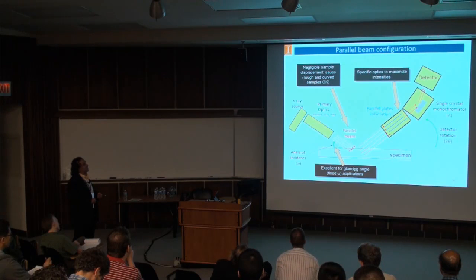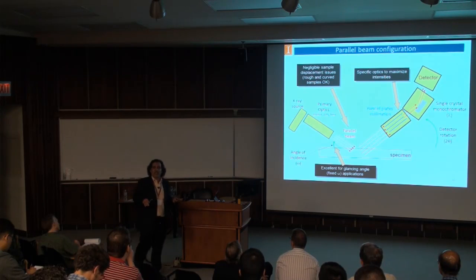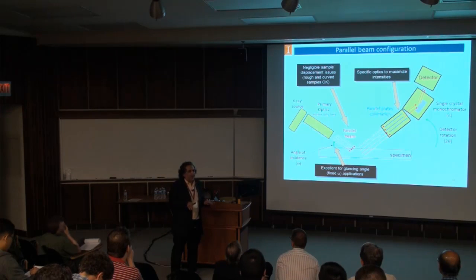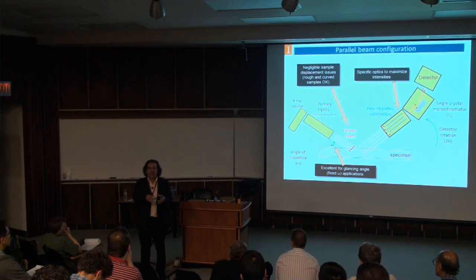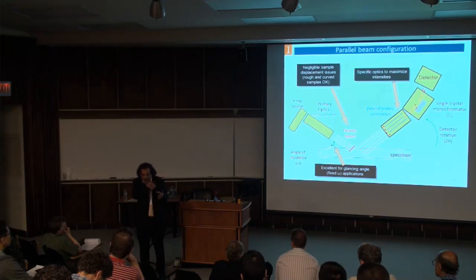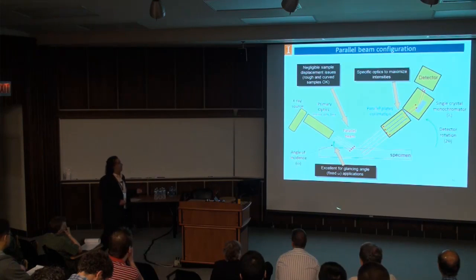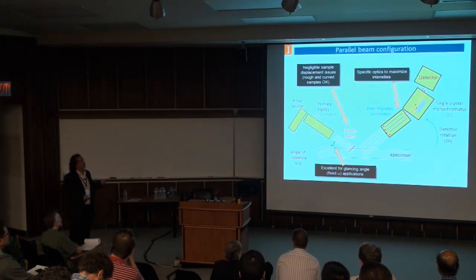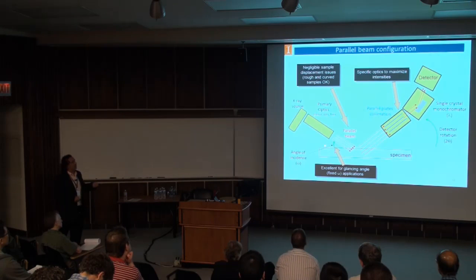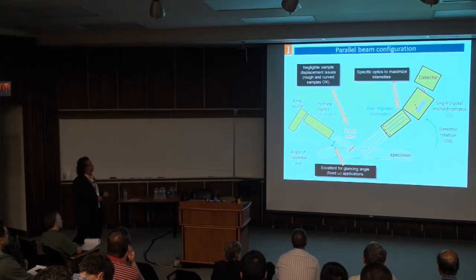It's very good also for glancing angle, which I'm going to talk about, and it's excellent for samples that are not regular shape. If you have something rounded, like an egg or a piece of a brick, or like I got a few months ago, a piece of a piston from Caterpillar that had a weld. The welding part was a mess, a bubble and everything looking ugly. They asked me to measure there. If you do Bragg-Brentano, it's going to be a mess. You don't see peaks. Peaks are very weak. Parallel beam is excellent for that. Thin films, irregular samples, glancing angle, bulk pieces, it is a great configuration to use.